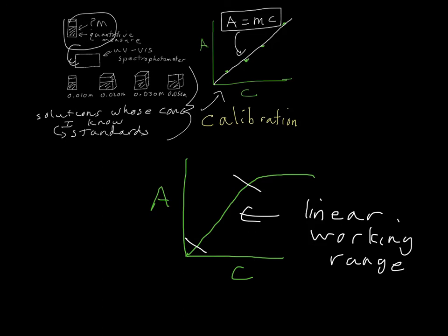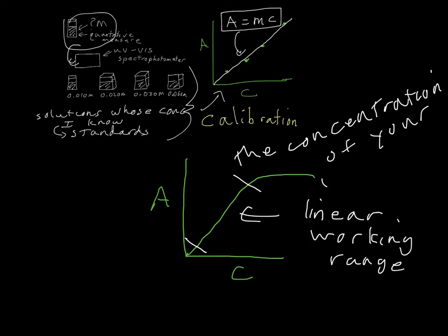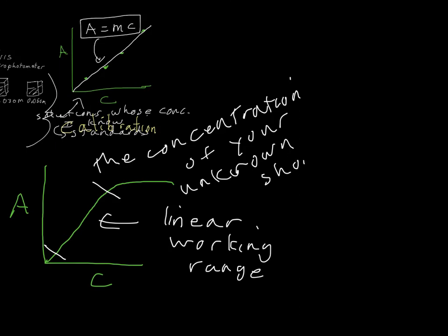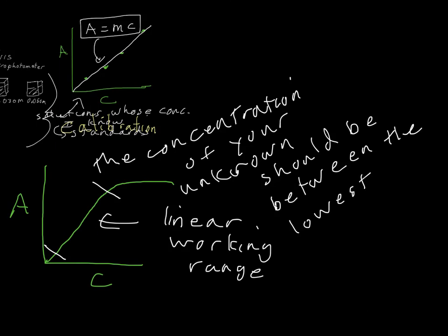I usually define the linear working range this way: the concentration of your unknown should be between the lowest standard you use to calibrate your instrument and the highest standard you use to calibrate your instrument.